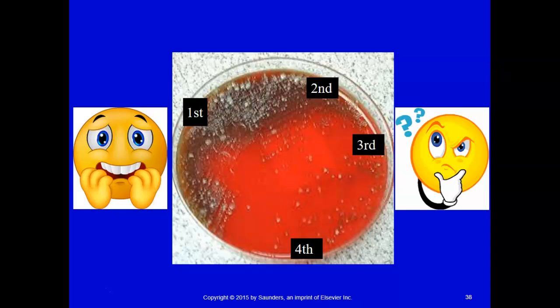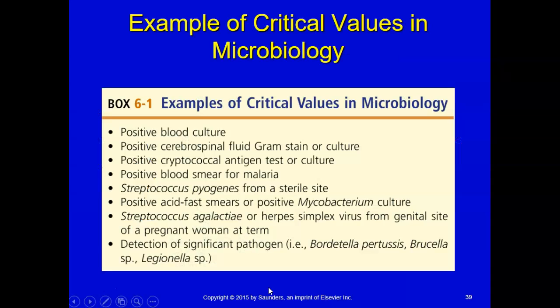We're going to also check our other plates. Is there growth on MacConkey? Is there growth on the CNA? And then we're going to look for isolated colonies. So whoever did this streak plate, this looks really good, because this is our goal right here, ladies and gentlemen. Before we can work up any culture, which means identify the bacteria to genus and species and tell the physician which antibiotics can be used, we have to have isolated, pure colonies to do our testing in microbiology. So this is really a lot of fun.